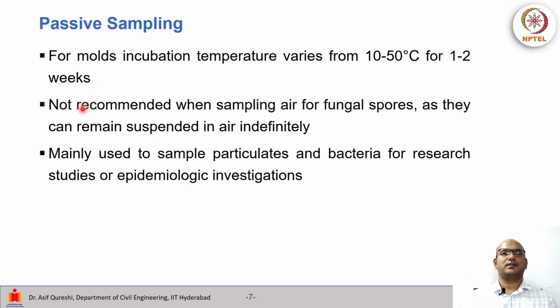Passive sampling is done for bacteria and these molds. It is generally not recommended when sampling for fungal spores, because the fungal spores will possibly remain suspended in the air for a very long time or indefinitely.